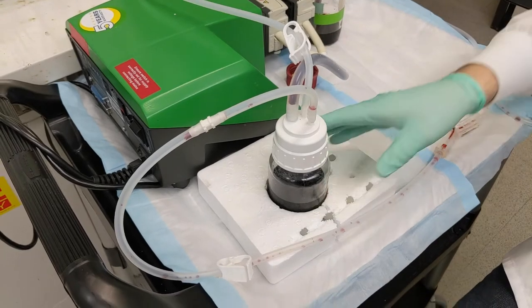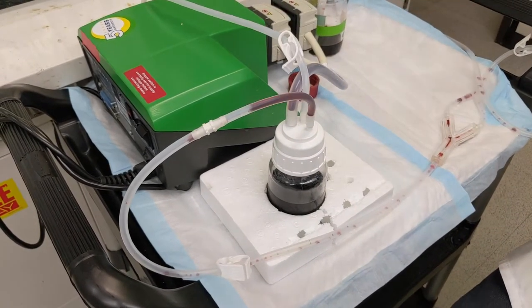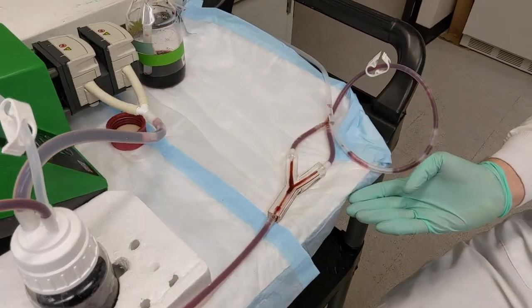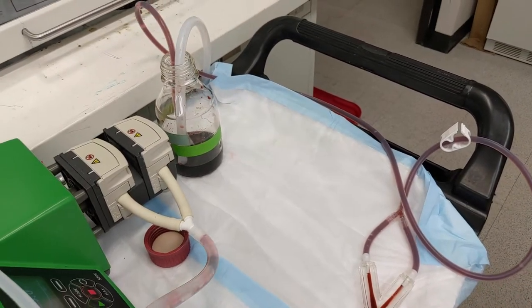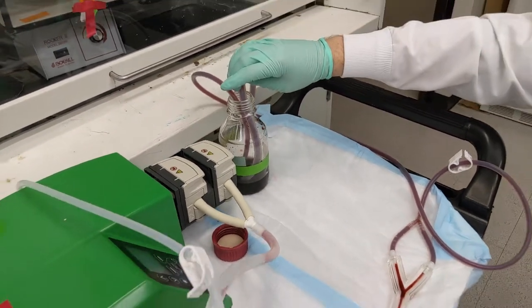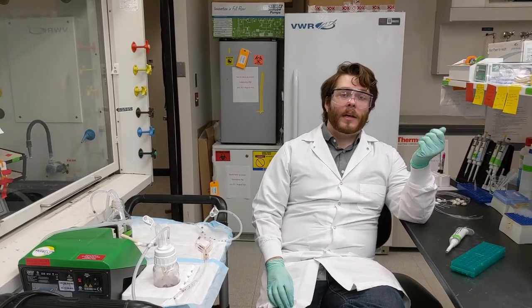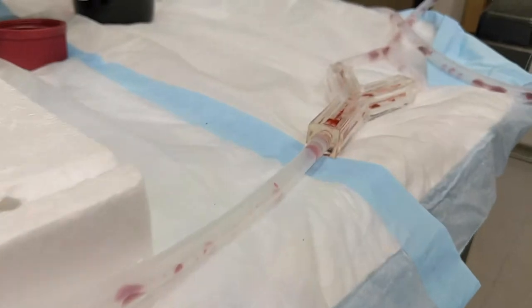This dampens it, so like blood in real life, your blood in you is very laminar, and then it flows into here. And once the blood's inside of this, the particles are able to adhere slowly to the endothelial wall that we put inside. Here in the Eniola lab, we focus on drug delivery, particle adhesion, all in human blood.